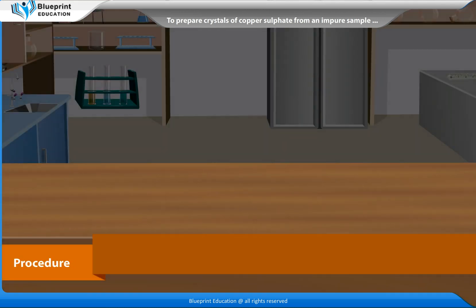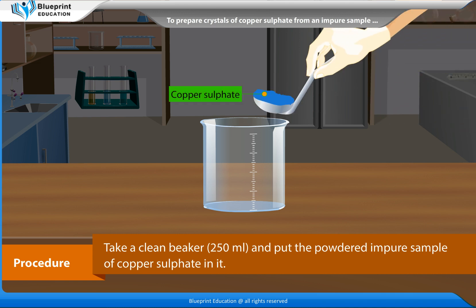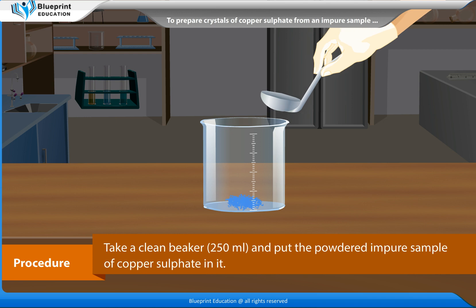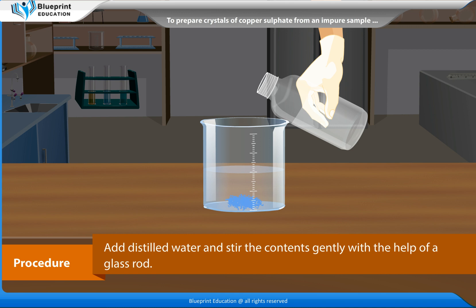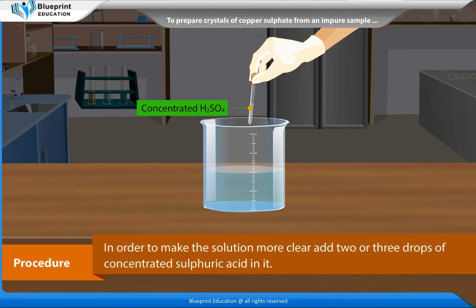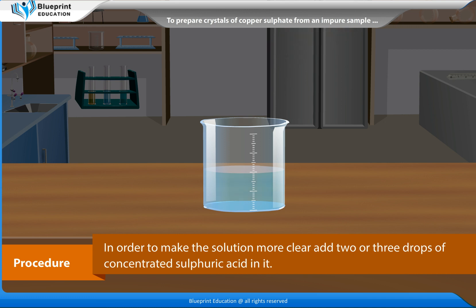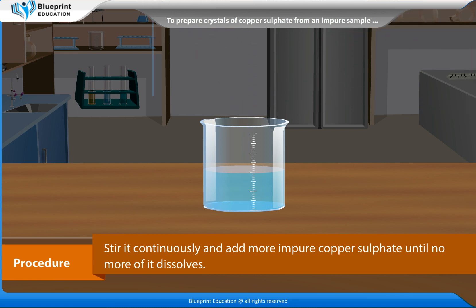Procedure: Take a clean 250 ml beaker and put the powdered impure sample of copper sulphate in it. Add distilled water and stir the contents gently with the help of a glass rod. In order to make the solution more clear, add 2 or 3 drops of concentrated sulphuric acid in it. Stir it continuously and add more impure copper sulphate until no more of it dissolves.